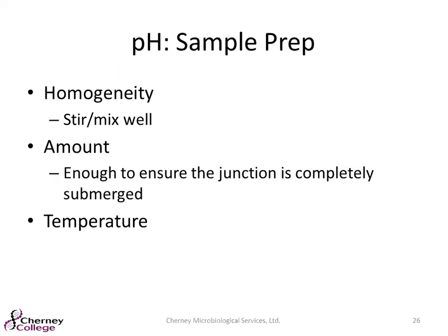And then we'll go on to pH. Again, all of these are critical to stir and mix well. You want to make sure that you have enough sample so that when you put that probe in there, the probe is fully encased around that product. And temperature is very critical for pH. It's very temperature dependent. If you have a higher temperature, you're going to have a lower pH. So you want to either make sure, again, that they're at room temp, or you have a pH probe system that can adjust the temperature and compensate for it.